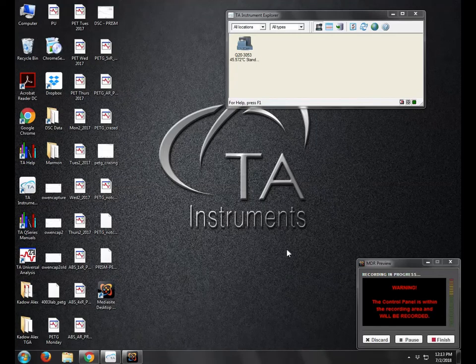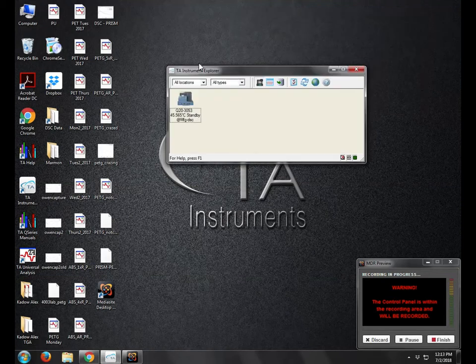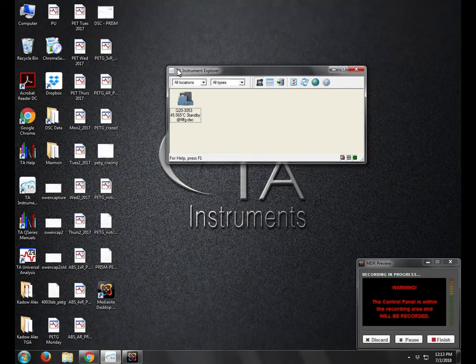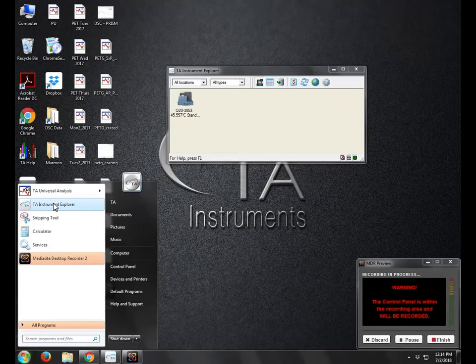Hi everyone, this is the video to run the differential scanning calorimeter software. The first thing we'll do is open TA Instrument Explorer. You can do that through this Windows key, and it's right here.